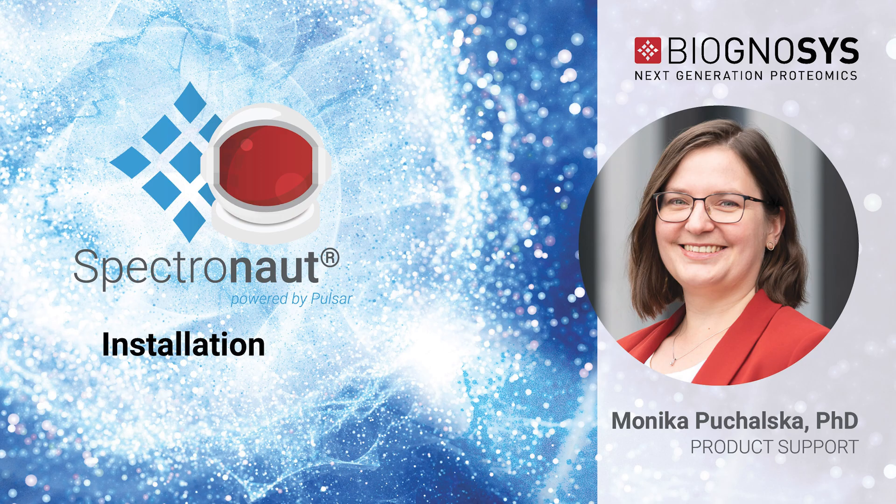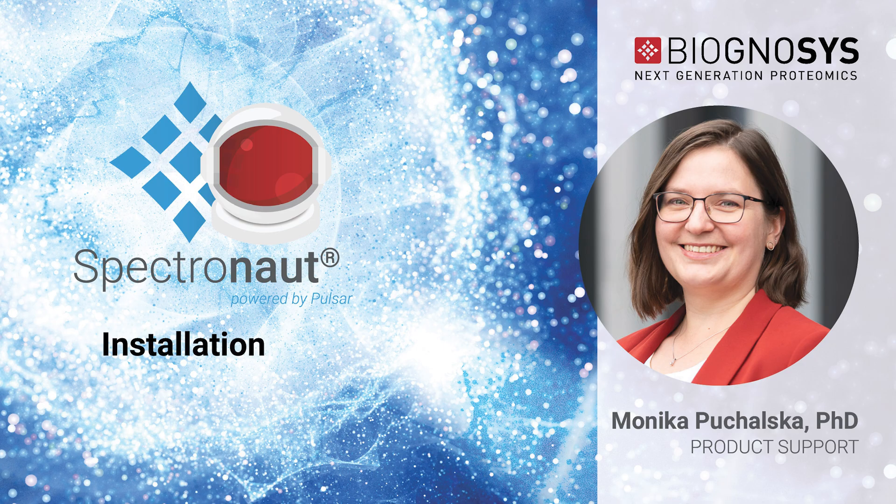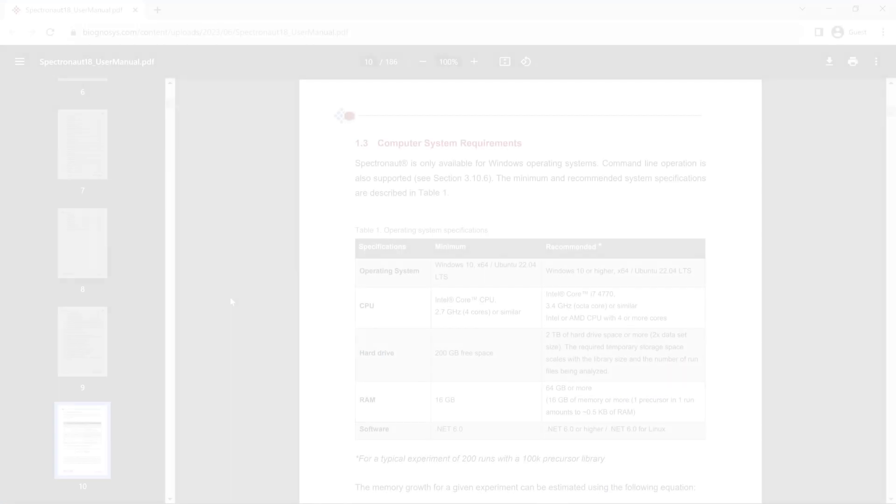Let's install Spectronaut. In this video, we will walk through Spectronaut installation in a Windows environment.